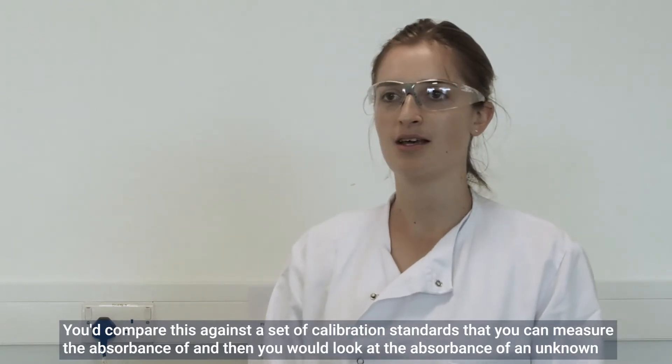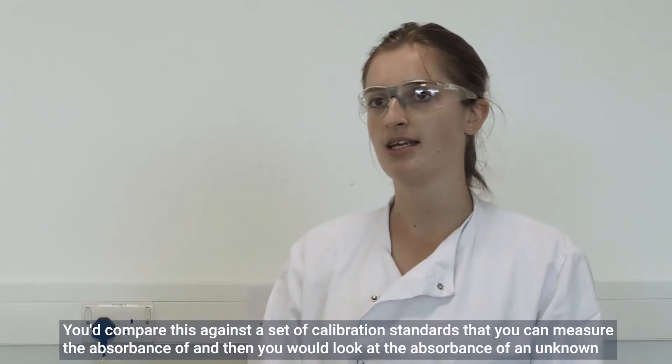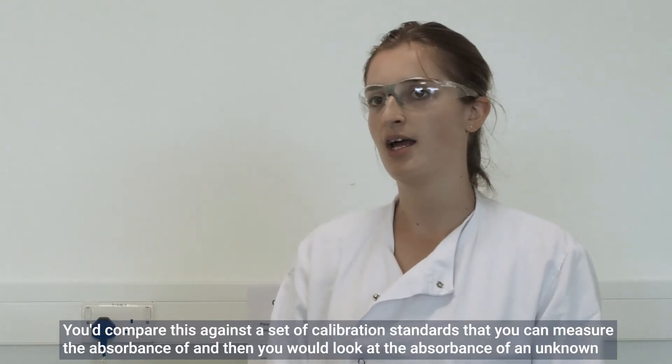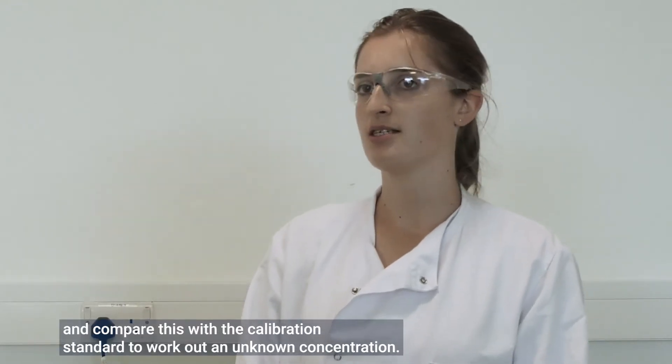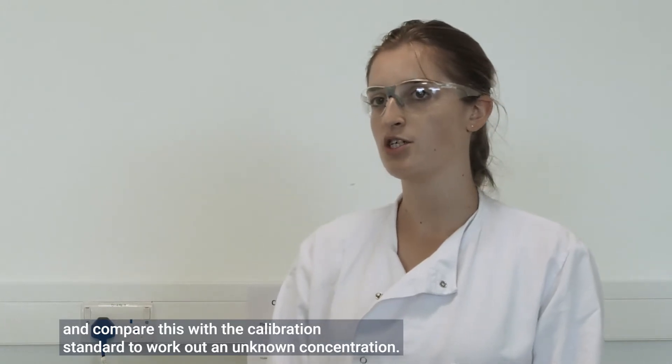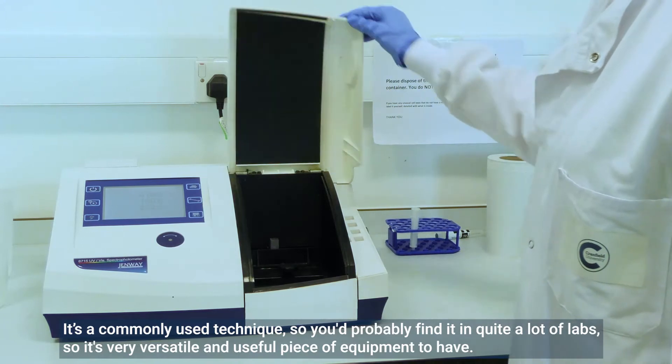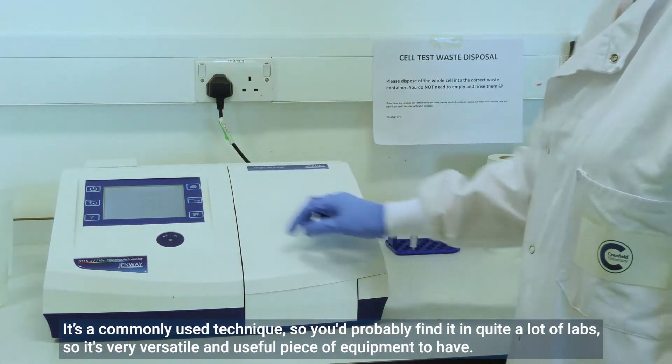You compare samples against a set of calibration standards — you measure the absorbance of those standards and then look at the absorbance of an unknown to work out an unknown concentration. It's a commonly used technique found in quite a lot of labs, so it's a very versatile and useful piece of equipment to have.